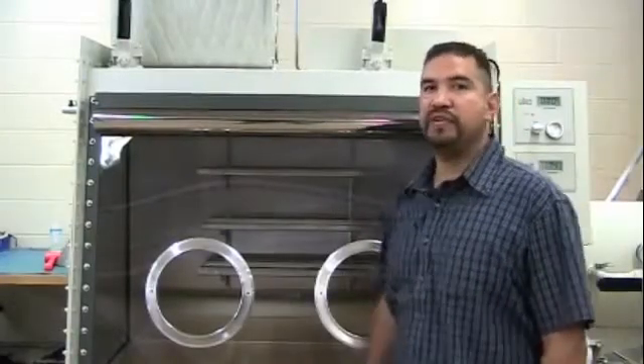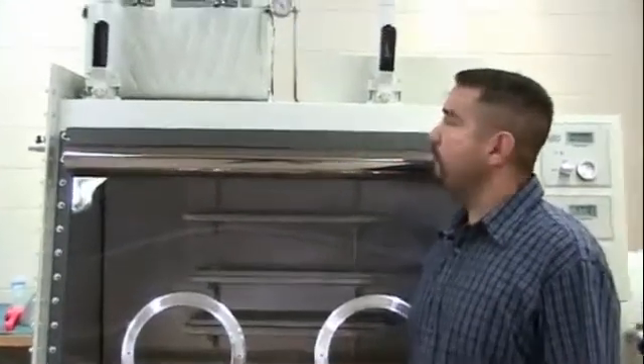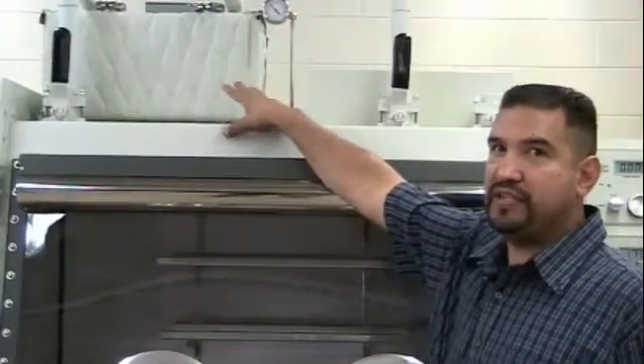Hello, my name is Guillermo Torres and I'm with Vacuum Atmospheres Service Department. Today we are going to show you how to replace the catalyst material in the purifier on an Omni lamp system.